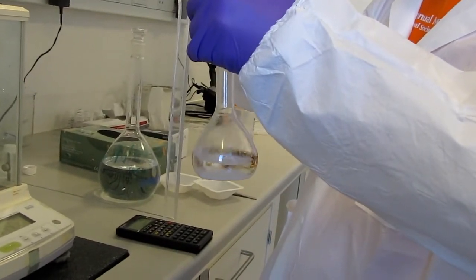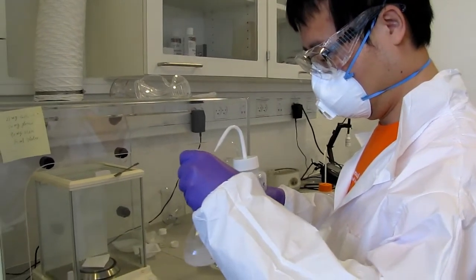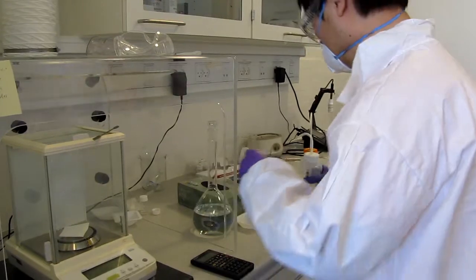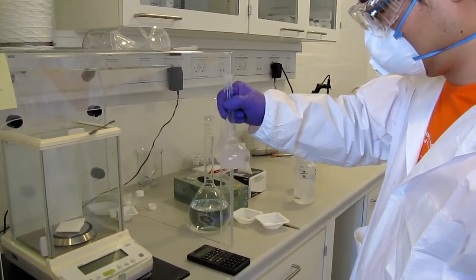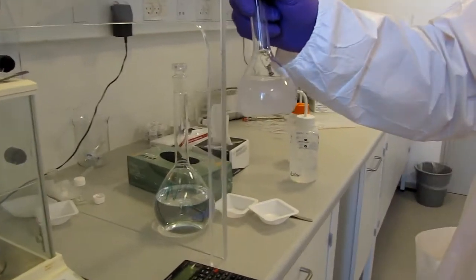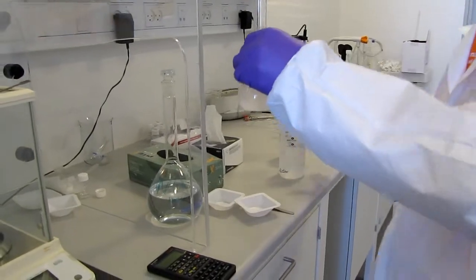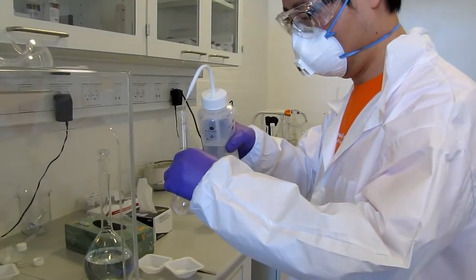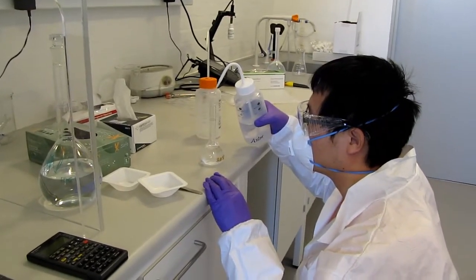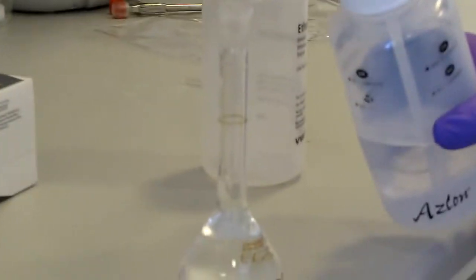This then is water. You're gonna leave it to stir, to make it dissolve quickly. If we fill to the line here, just 100 milliliter solutions.